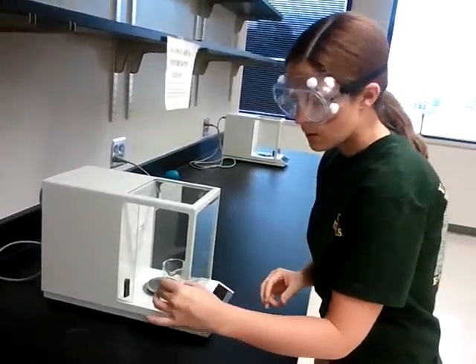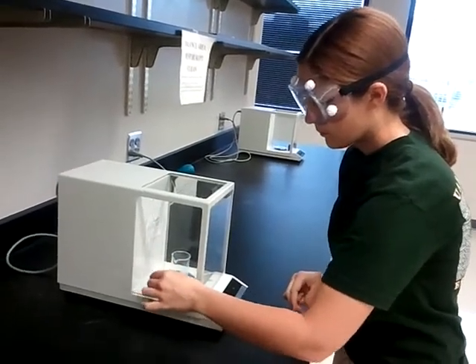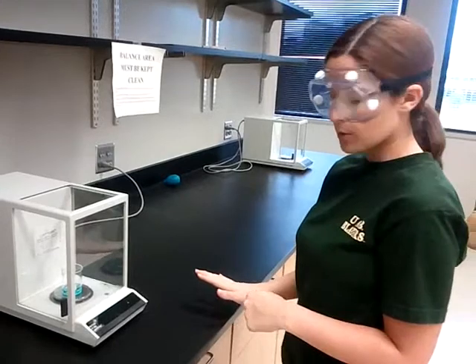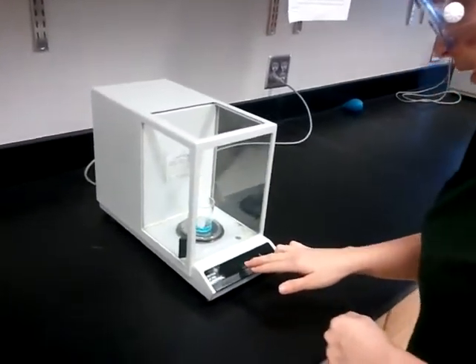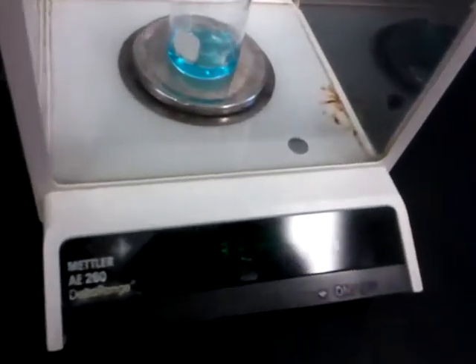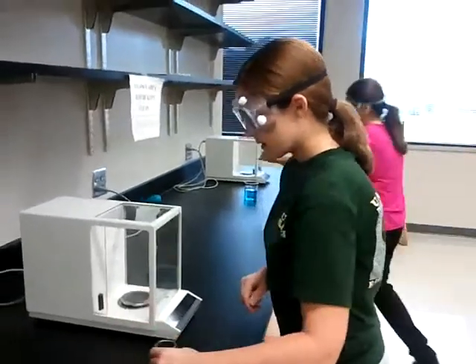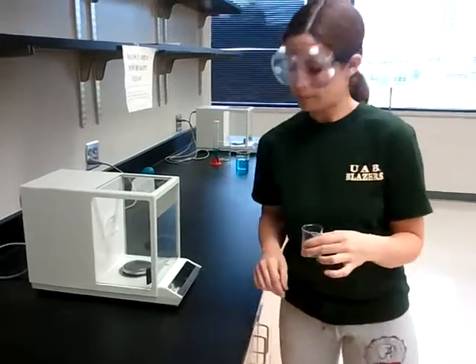Okay. You want to open the side door. Put your beaker in there, step away, and make sure that you're not touching the counter in order not to throw off the measurement. And it says that we have a weight of 36.7 if we round it off. 36.7 grams. Now we want to open our door, take our beaker out, and then shut it back.